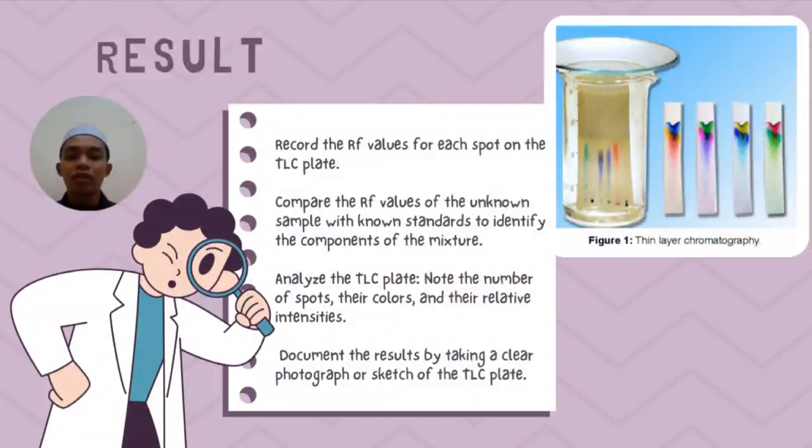Next, we analyze the TLC plate. Note that the number of spots, their color, and their relative intensity depend on their type. Finally, document the result by taking a clear photograph or sketch of the TLC plate.